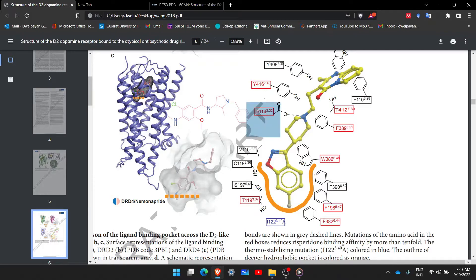We will replace the amino acid at position D114, which is a very crucial residue. For instance, if we replace it with an identical amino acid like glutamate — because aspartate and glutamate fall into the same family — the activity of the protein will probably not change. But if we replace it with a very different amino acid that does not have identical properties to aspartate, like proline, valine, or tryptophan, the activity may change. We will try to do that.